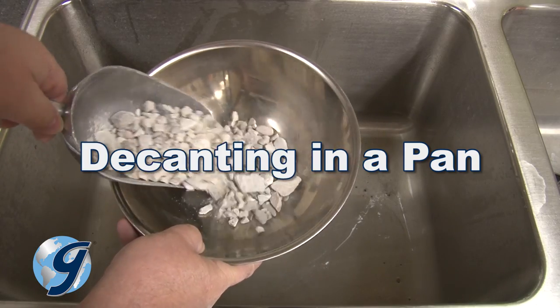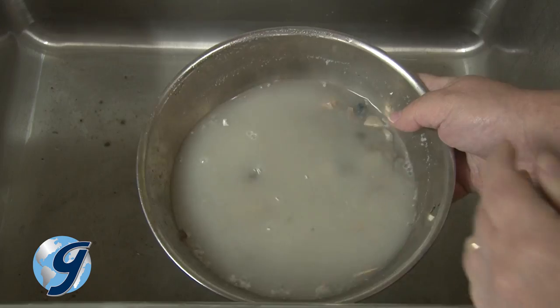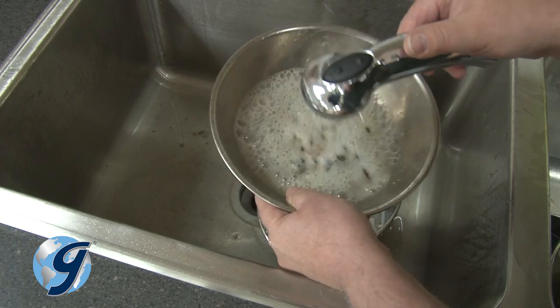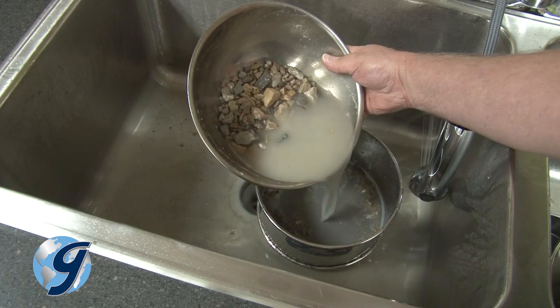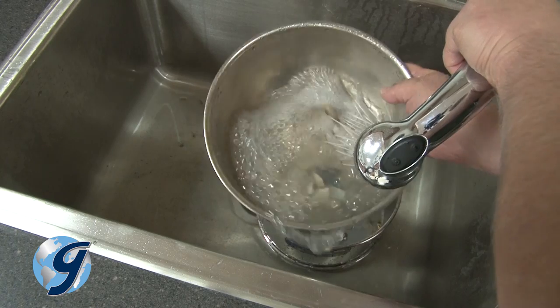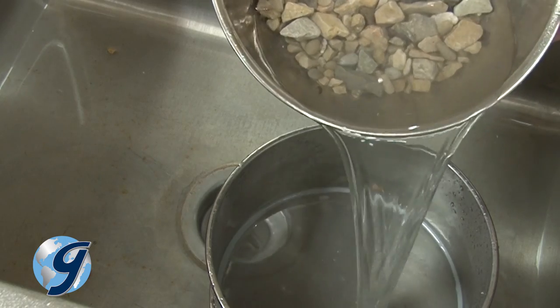A variation of this wet wash method is to place the entire sample in a pan covered with water, then agitated by hand. The waste water is decanted over a wet wash sieve and more water is added to the pan, continuing the process until the waste water is relatively clear.